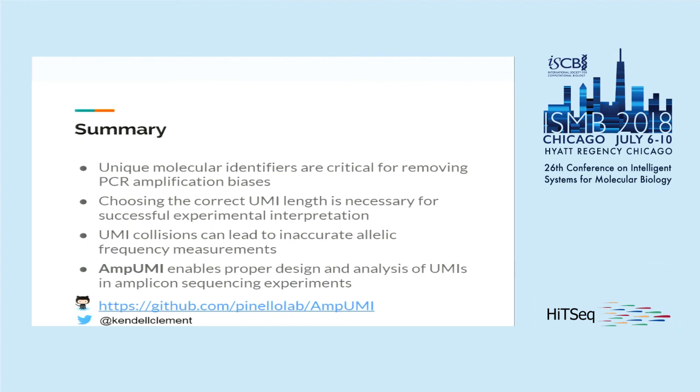That's definitely a drawback from a long UMI. You're going to have more sequencing errors. Yes, there's error correction you can do. There's a bunch of UMI deduplicators that will take that into account. That's the difficult part, that the UMI covers all the diversities of the sequence, so it's hard to identify whether it's a sequencing error or a true diversity region in your UMI. We assume that because your UMI pool should be pretty large, the sequencing errors shouldn't contribute significantly to this. And actually, there was a recent publication that showed that even if you correct for sequencing errors in the UMI, it doesn't actually contribute significantly to the outcome of deduplication. So, yeah. Thank you again.